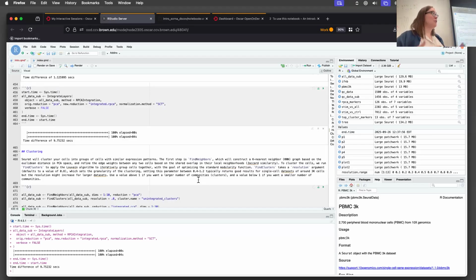Something is not right. He knew when looking at the clusterings that something funny was happening. So I said, okay, let's go back to the drawing board, and that was why we tried the RPCA. It isn't a super statistically rigorous answer, but in my case it's usually to consult with someone who knows the system and see if it seems reasonable and go from there.